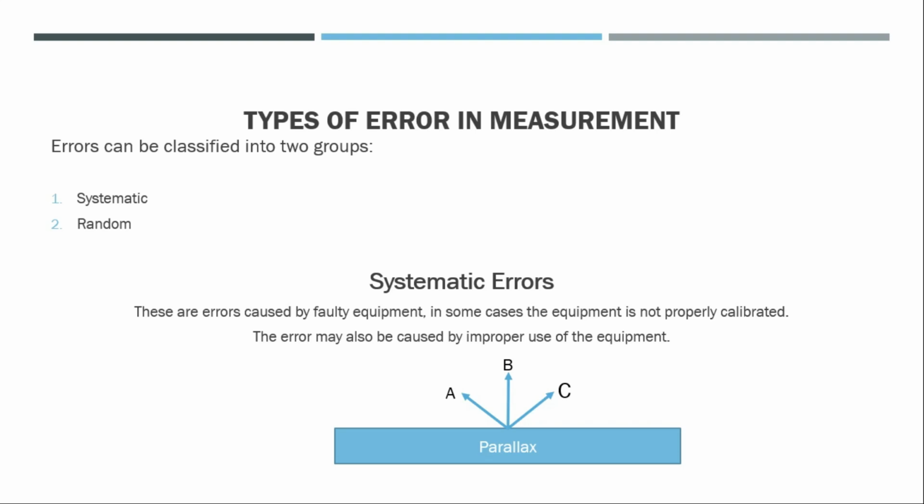Now, for this tutorial purpose, or for any measuring purpose, it's very important you stand directly over or directly in front of whatever equipment you are using to measure. You should always try to be at eye level, more so when you are using the measuring cylinders or the beaker. You want to get it at eye level so you can take a proper reading, reading from the meniscus of the liquid in a measuring cylinder. So we're going to move on.